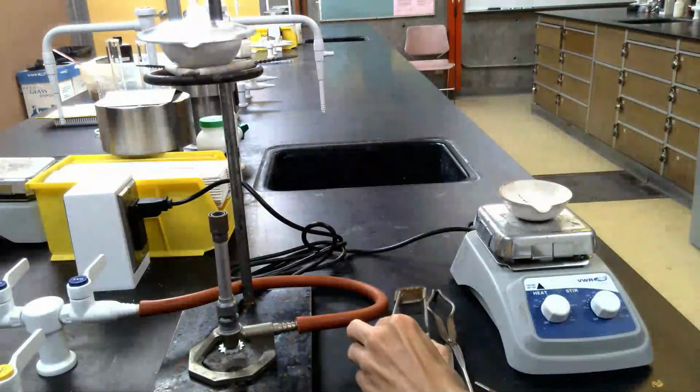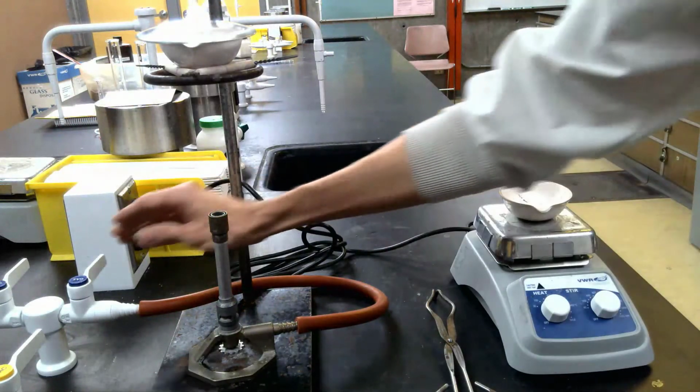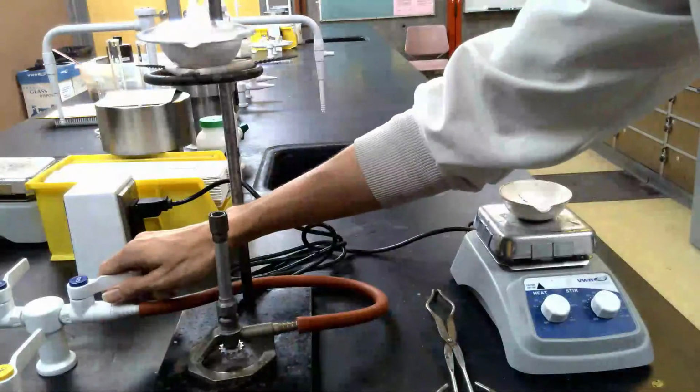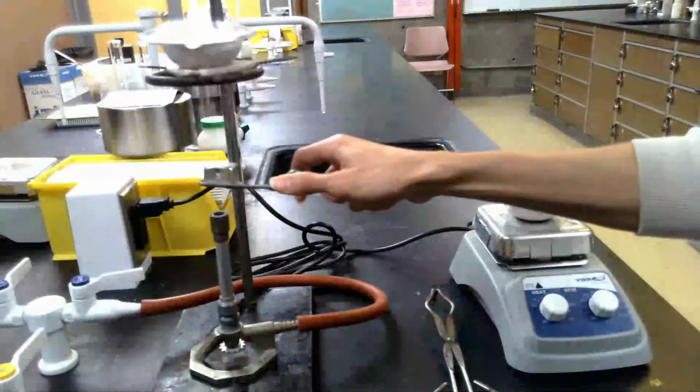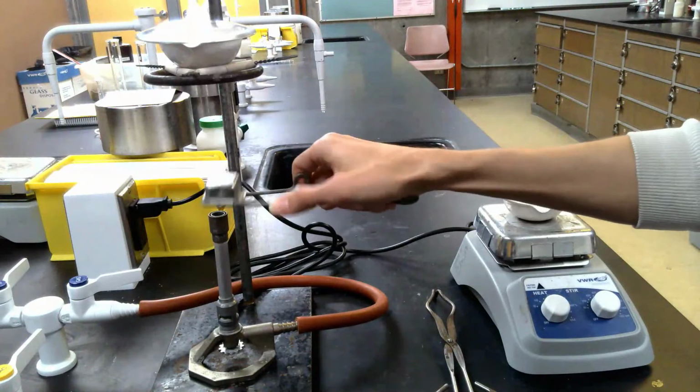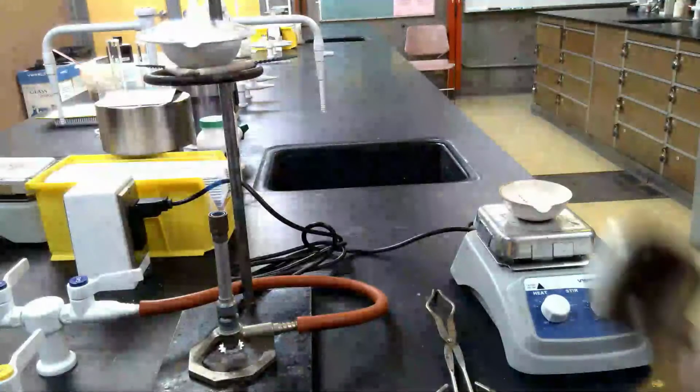Let me grab my striker, start the gas flow again. There we go.